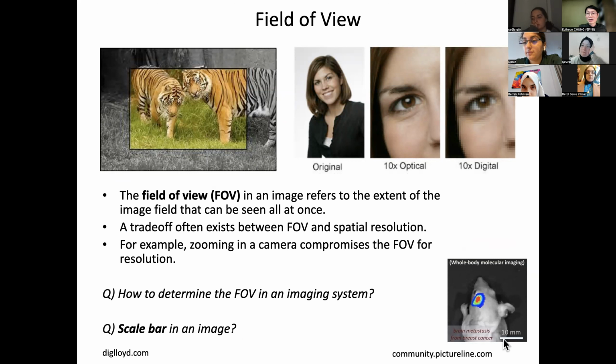One can readily say, hey, this is 1 centimeter, that must be a mouse. So this is what we call a scale bar. With the scale bar, you can readily say this is about 30 plus millimeters, which we call the field of view. So whenever you do microscopy imaging, you had better have a scale bar or be able to tell the field of view. So you can see 2 different fields of view.